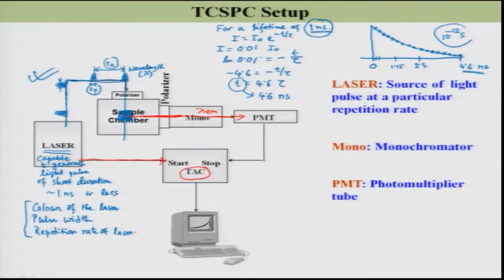This tach is a time to amplitude converter. So, at the time the laser excites your sample, at the same time it sends another signal to this device, tach.